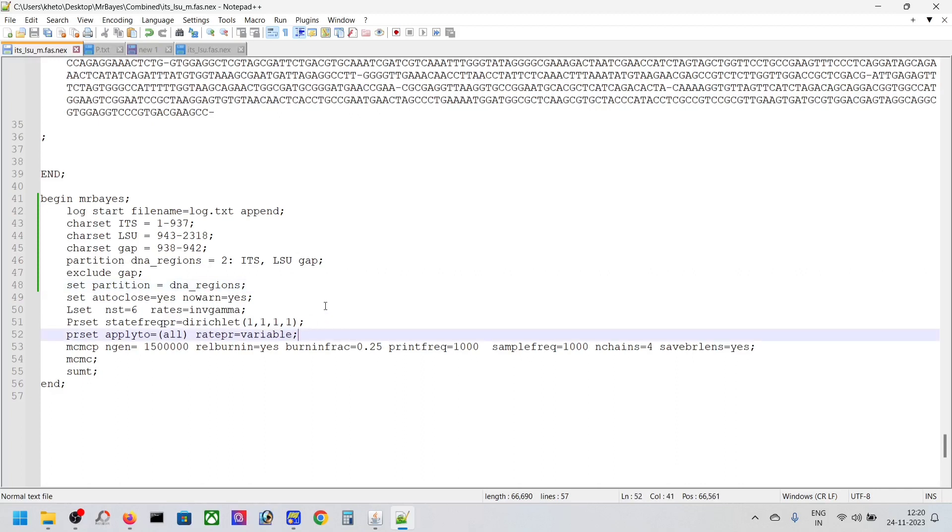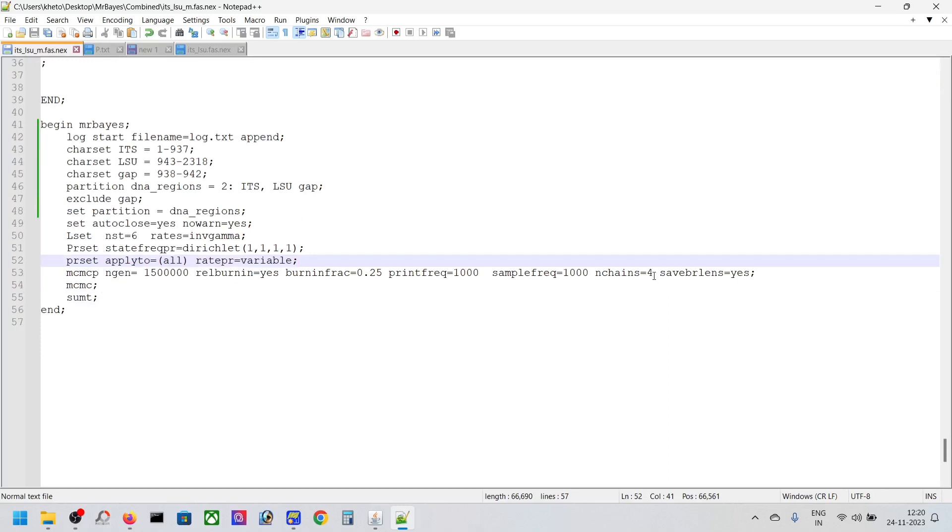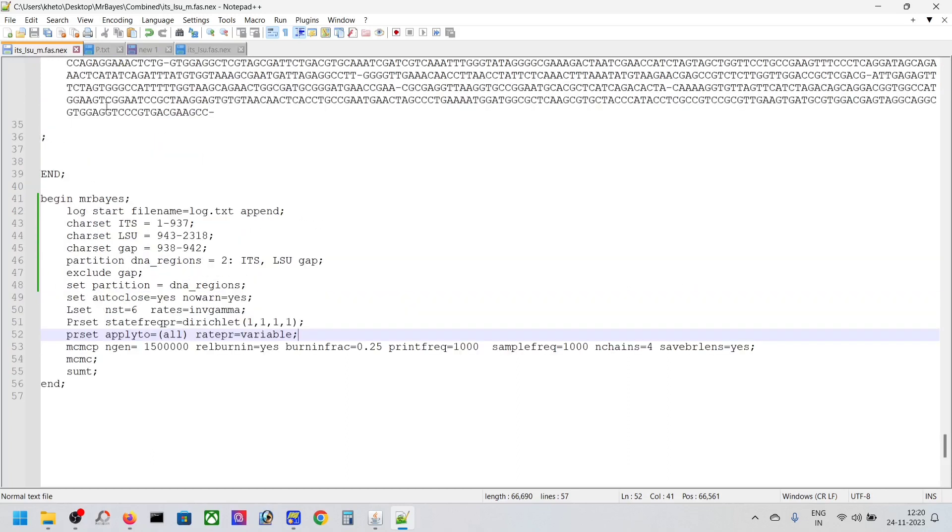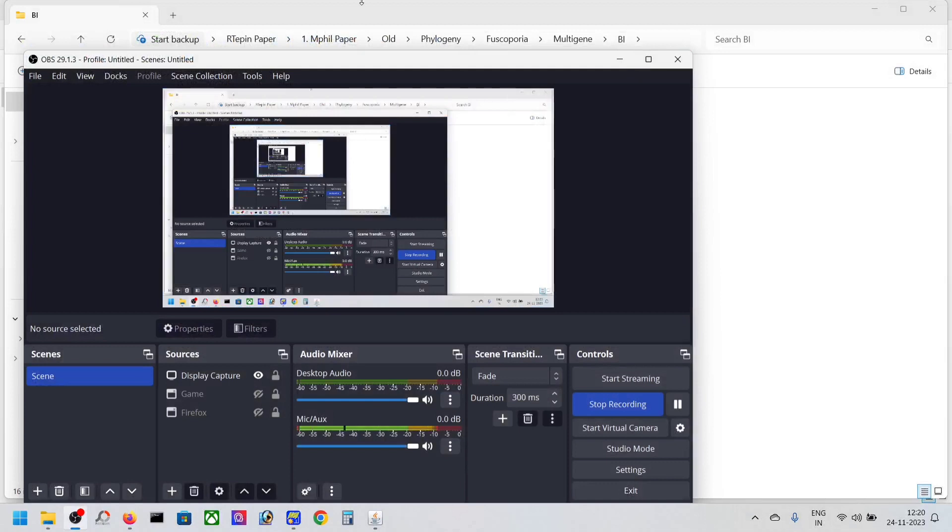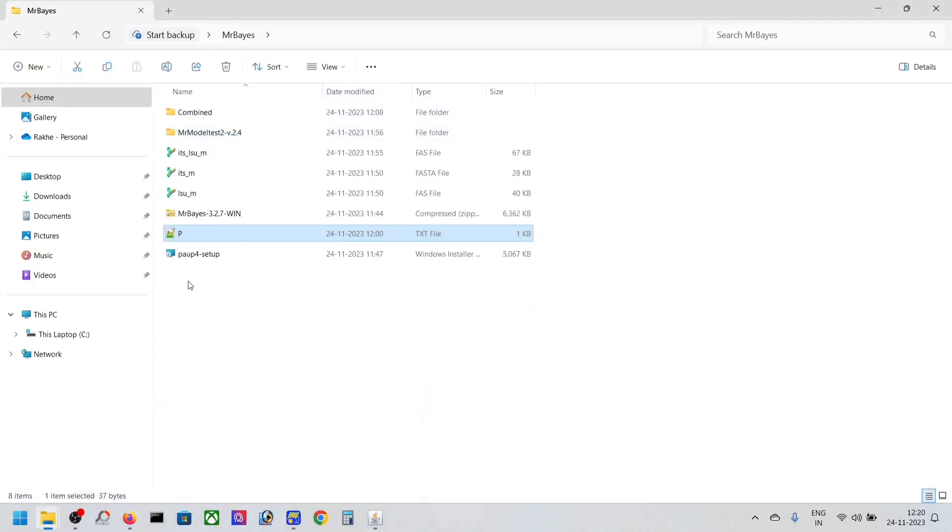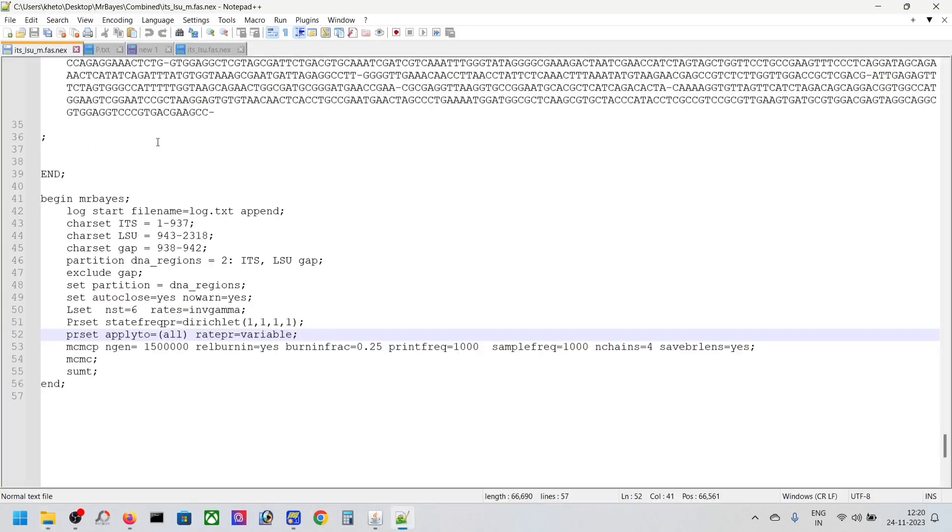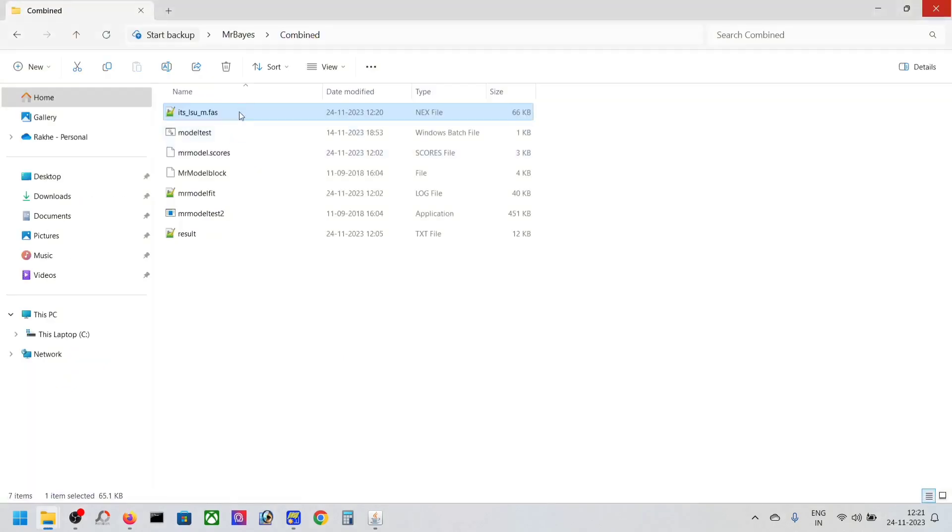This is our parameter number of chains. So now we're done with our MrBayes block. This is our folder, and this will be the file that we're going to analyze. You can rename this MB, which means MrBayes. You can copy this one, keep it for any further errors, and make a folder here called Bayesian Inference.